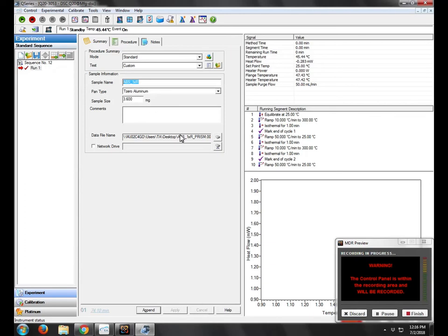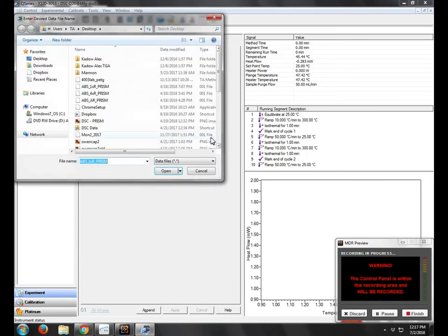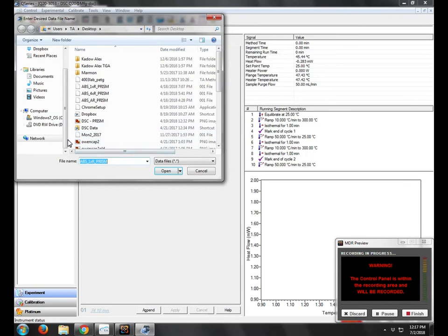Next, we will record the file name. So just click this, type in whatever file name you want.